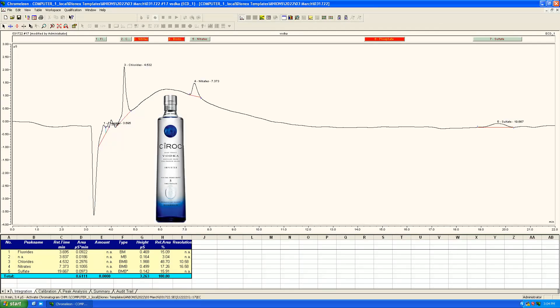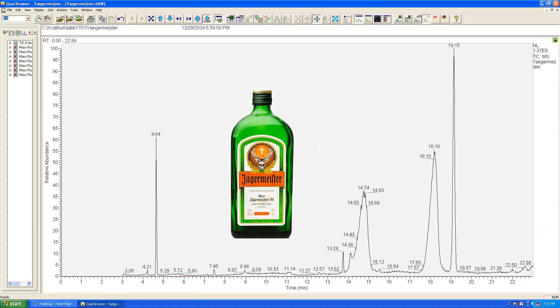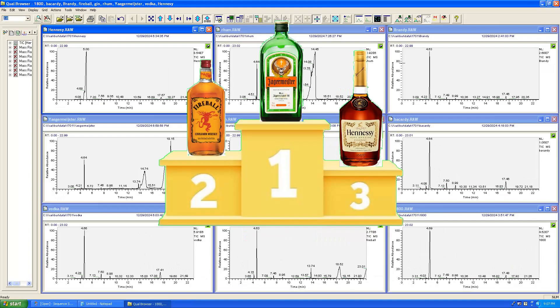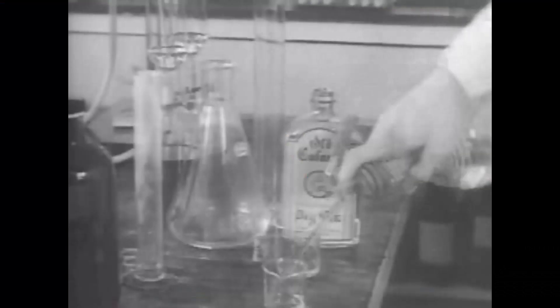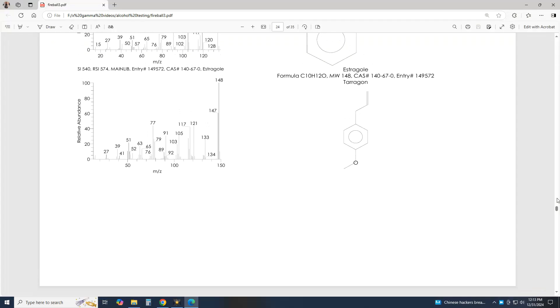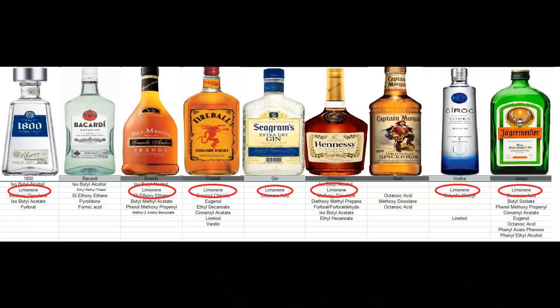Vodka is the cleanest liquor and Jäger the dirtiest, with Fireball and Hennessy as a tie for second place. Vanillin was only found in Fireball but I was expecting it in rum as well. Benzoyl chloride was definitely in Fireball but in such a small amount it did not get selected in the analytical report, so I wouldn't worry about it. It's interesting to see natural limonene or as an additive again here. That stuff is everywhere.